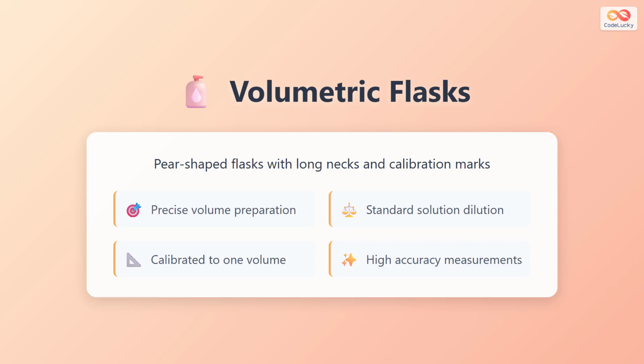They're essential for preparing standard solutions and performing accurate dilutions. When you need exact concentrations in your solutions, the volumetric flask is your go-to tool. Each flask is designed for just one volume, ensuring maximum accuracy in your measurements.